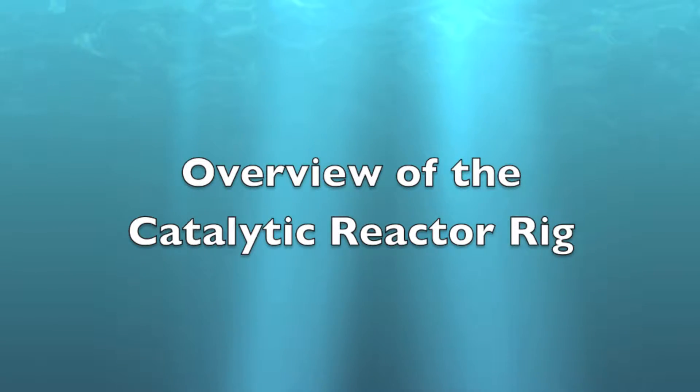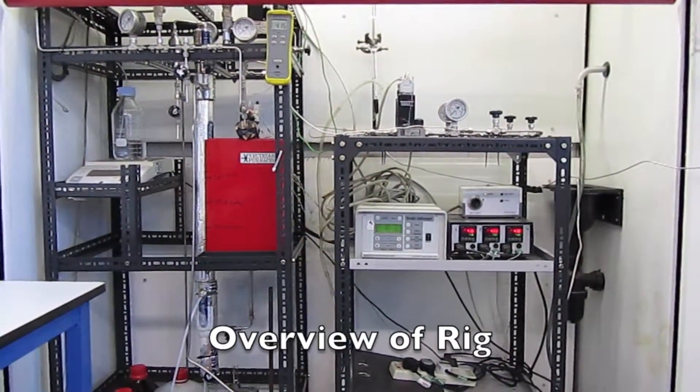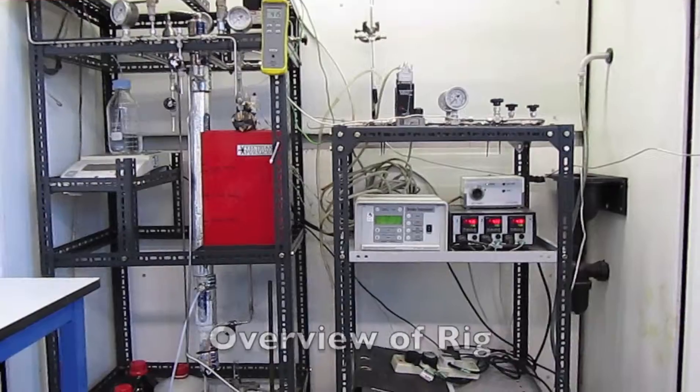In this video we will be studying the elements of the catalytic reactor. The catalytic reactor system requires pressurized gases with air, hydrogen and nitrogen currently in use.